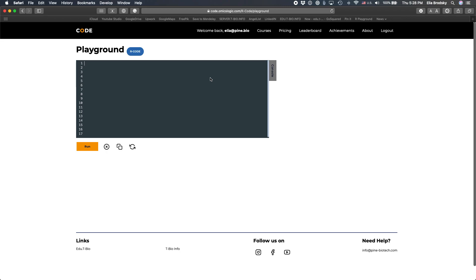The first thing we'll do is use a library called ggfortify. ggfortify is useful for principal component analysis and things like autoplot, which is a modification of how ggplot works, specifically for this kind of data.